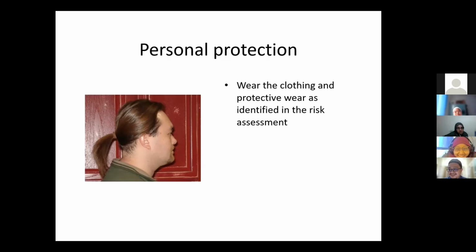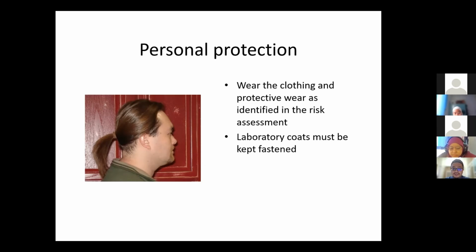Okay, tapi kalau lelaki bukan setakat kena pakai cap tu, janggut pun dia kena pakai cover. Macam kalau saya masuk the ICOP punya pharmaceutical plant, janggut pun dia kena cover because all these hairs dalam environment macam tu dia kena tutup. Tapi kalau lab biasa, hospital lab, research lab, they need to tie dia long hair. Okay, lab coats must be kept fastened.